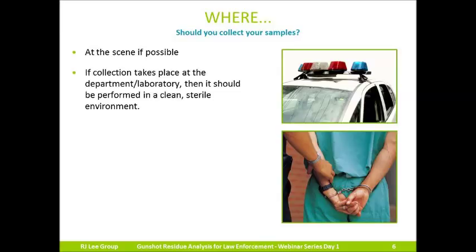When collecting samples from the hands of a subject, or bagging a subject before handcuffing him or her, we always recommend wearing latex gloves, and please do so. A pair of latex gloves serves to protect against any potential transfer of particles from you to the subject. They also serve to protect you in court when you are questioned about best practices when collecting samples.